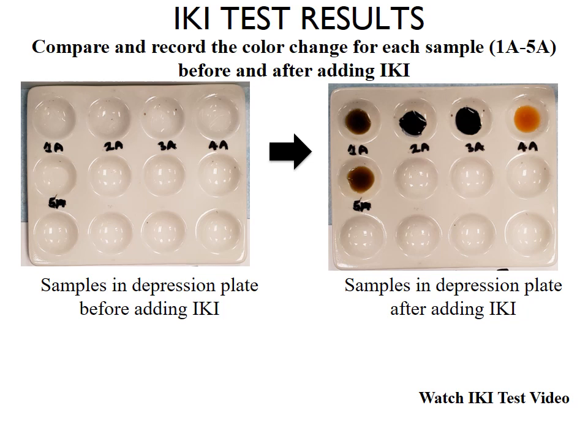The 2A and 3A look as if they still have the starch in them, and it means that there is no hydrolysis, because the starch is supposed to be hydrolyzed if you have your amylase acting on them.